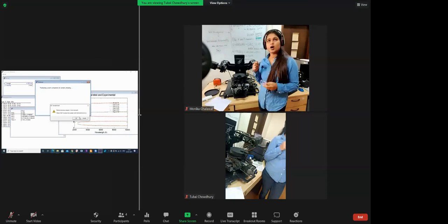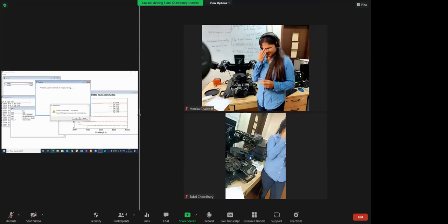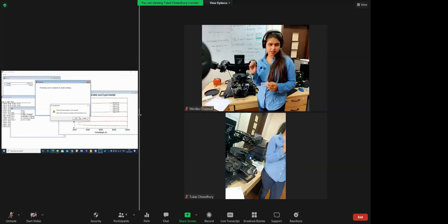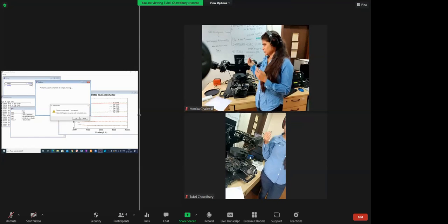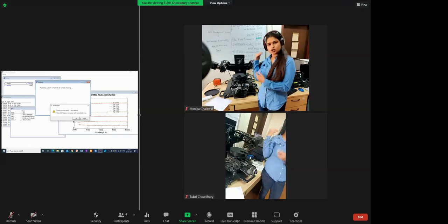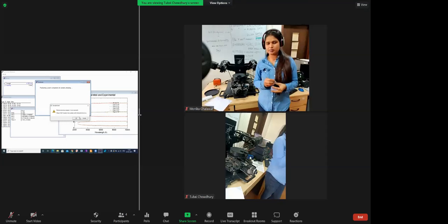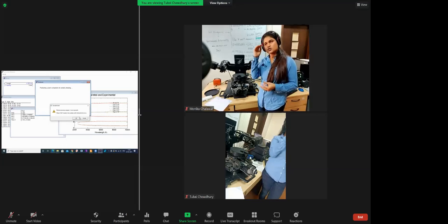With the software we are using, we cannot directly plot RP versus RS or any kind of thing here, because this is an old model and old software, with old keys. But in new versions of the software, similarly as N and K are coming, there is an option of RP and RS.